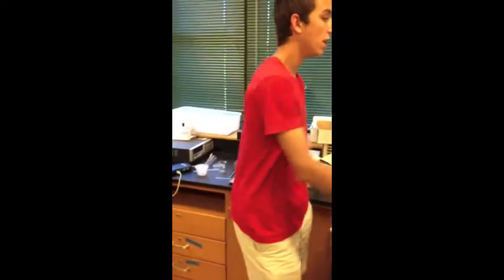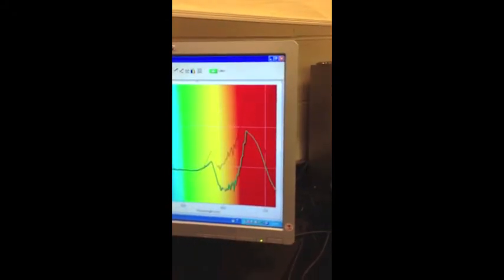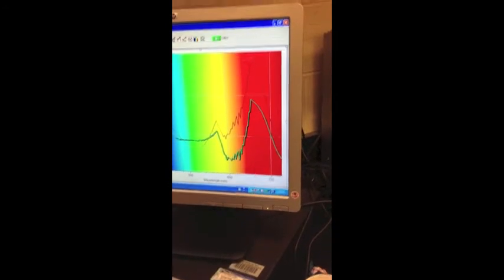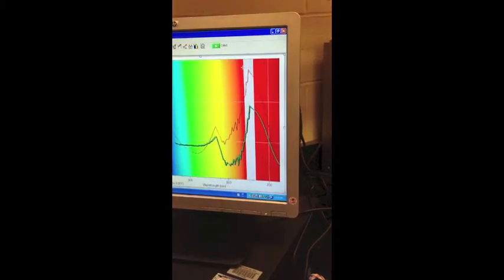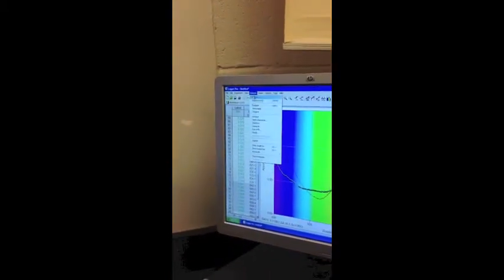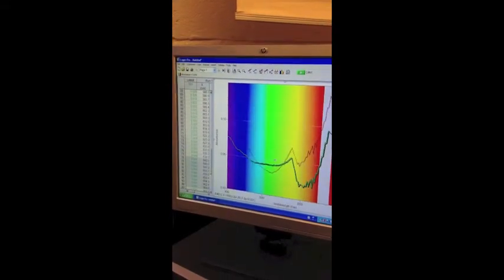There's one thing we can do to apply with our data. So as you can see, if you come over here next to the computer, we have peak absorbances at different wavelengths. And they're actually mostly lined up. You can see it's somewhere between 600 and 700. So we want to find what these peak absorbances' corresponding wavelengths are. So we will highlight all the area in which these reach their peaks. You go over here to Analyze, to Statistics. And we'll do all 3 runs that we did.